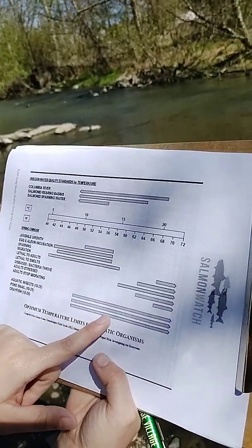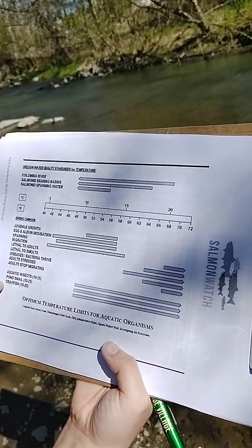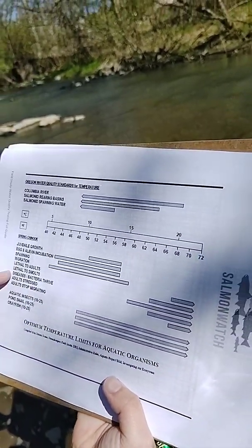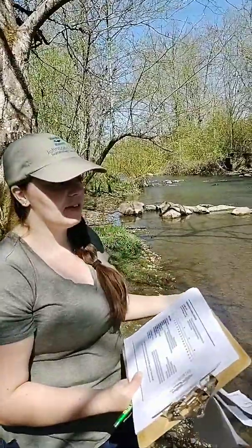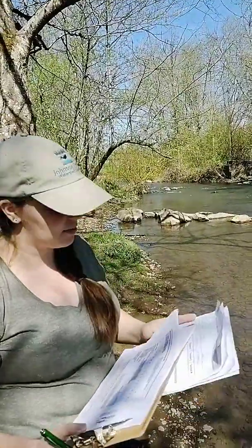It also covers the bottom ones here, which is aquatic insects, pond snails, and crayfish. And it does not cover these bars here, which look like lethal to adults, lethal to smolts, diseases and bacteria, so all the bad stuff. So that's a pretty good score, right? The temperature is hospitable for salmon. It's not going to kill them. It's a fairly decent temperature, which is great. That's actually one of the most focused tests that we do here at the council.